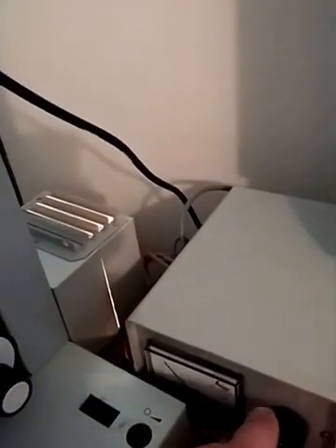Here's a spare — it's a backup Xenobot, I guess it's called. I think they're 10,000 hours per bulb, so you're not going to be running out of bulb anytime soon. And this is your power box here — it's all adjustable. You can tell from the light coming out of there.